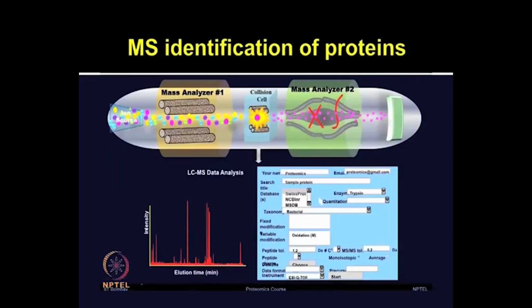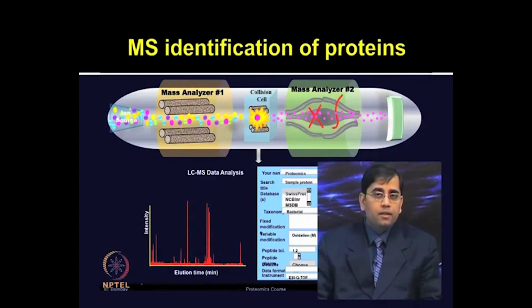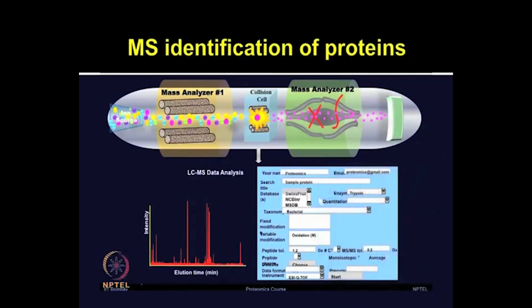These 38 differentially and significantly expressed proteins were excised from the gels and subjected to MALDI-TOF mass spectrometry for analysis. The authors also employed a liquid chromatography tandem MS/MS system for analysis of these spots, and the data was analyzed using the Mascot search engine.